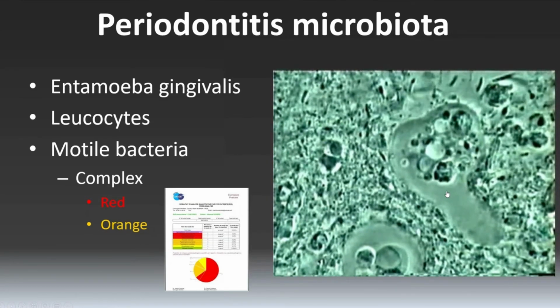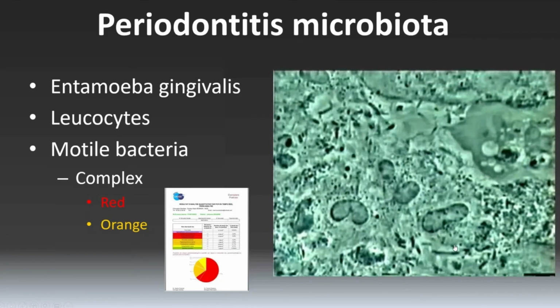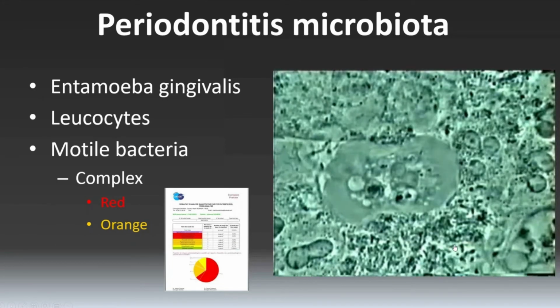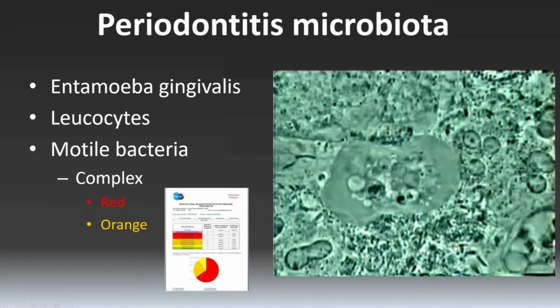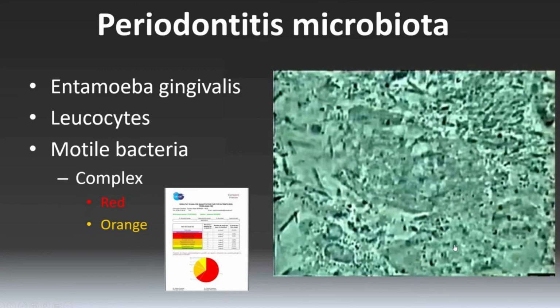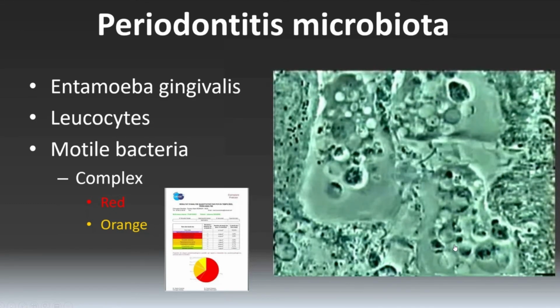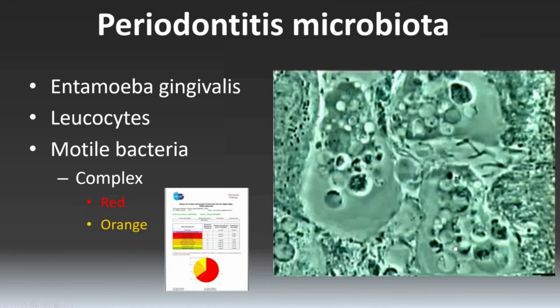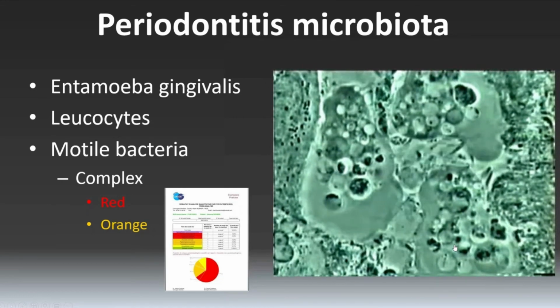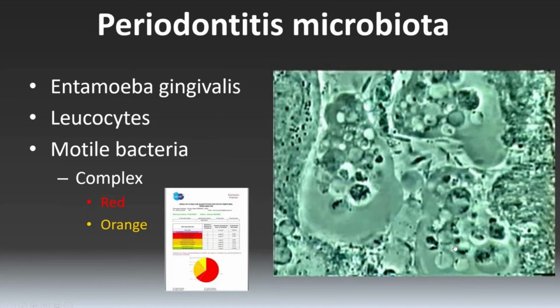All patients that see those parasites going like this with the pseudopode, what is this? I mean, those are larvae parasites. Yeah, we find them in periodontal disease and all active periodontal disease. We see the bacteria too, so we're going to remove them all. We'll remove the amoeba. See here, 3 amoeba. It's a lot of them. Some bacilla, less spirochete, mostly bacilla, orange complex, red complex, and parasite. So this is microbiota of periodontitis.